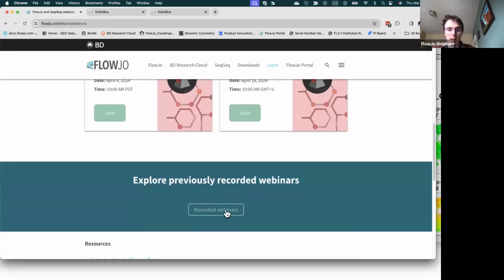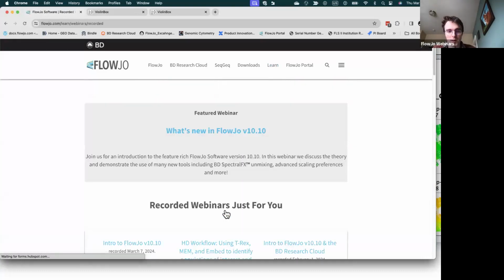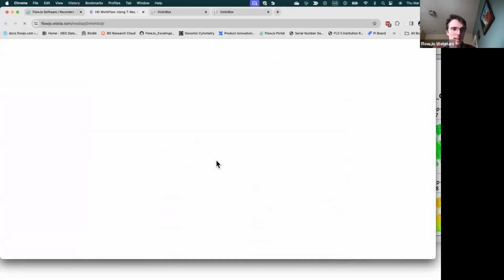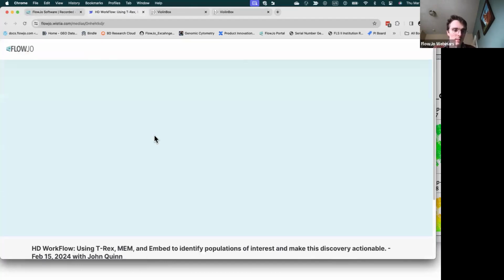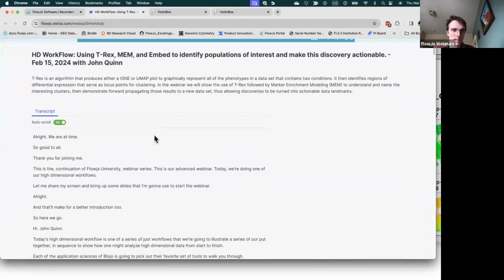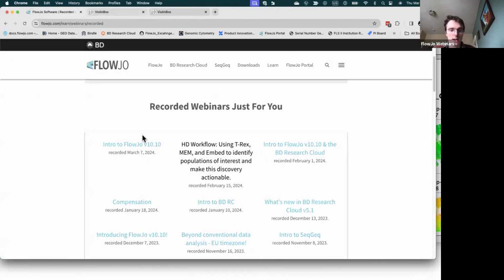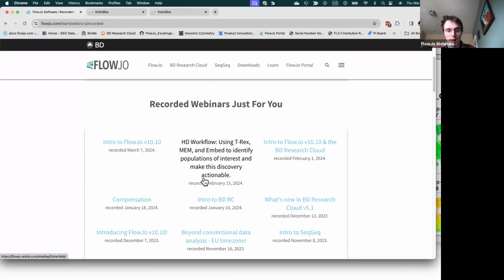Definitely keep your eye open, but also you can see in the recorded webinars, we just had an advanced webinar in February, for instance. So you can go see the recording of that webinar here. Sometimes they include the data set. I don't know if this one did. No, I'm thinking it didn't. But you can at least check out the recording and see all the tools they're using. They use T-Rex, they use MEM again, and they used Embed. T-Rex is a really cool tool. I would check it out.